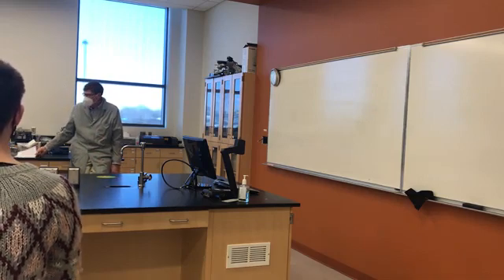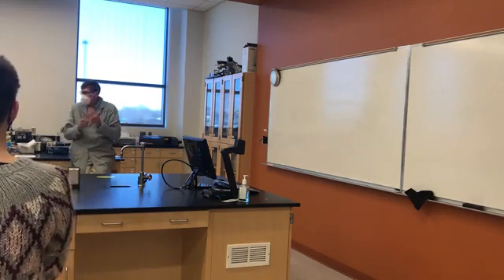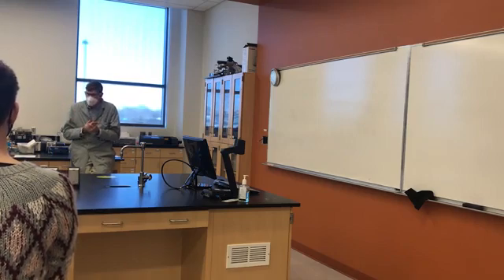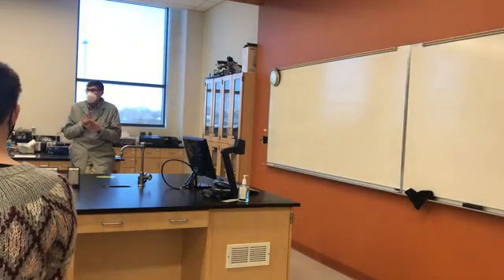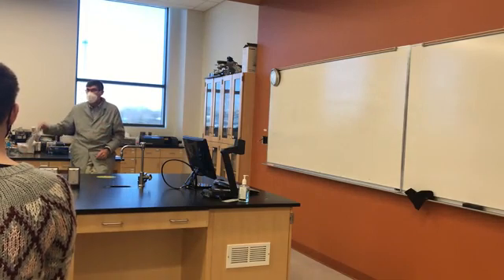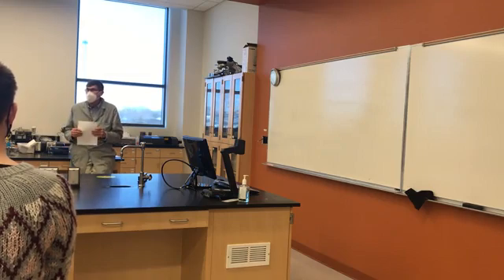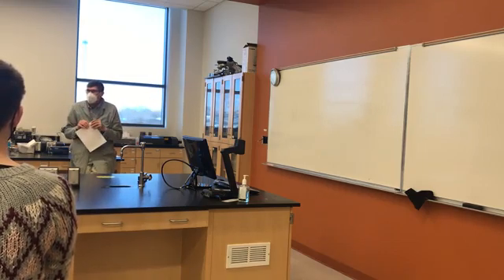So you don't have to do the standard introduction and principles, etc. Just basically discuss the four spectra, and I will post those up on Canvas. Discuss the spectra of the two films and the two oils, the important features of each, and then answer the questions that are asked in the handout, and that will constitute your report for this week. So for this week only, your lab report will be a little bit different.